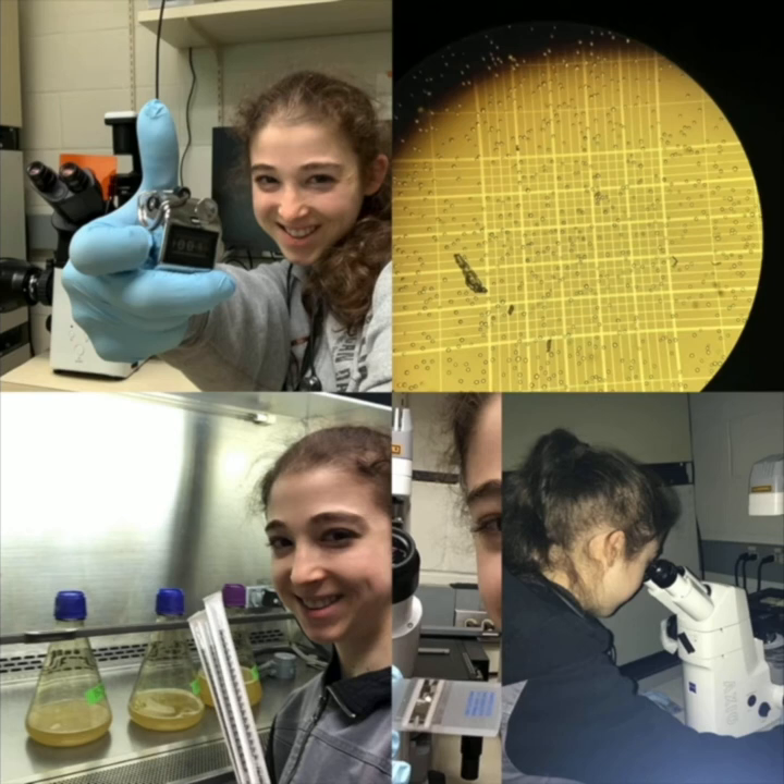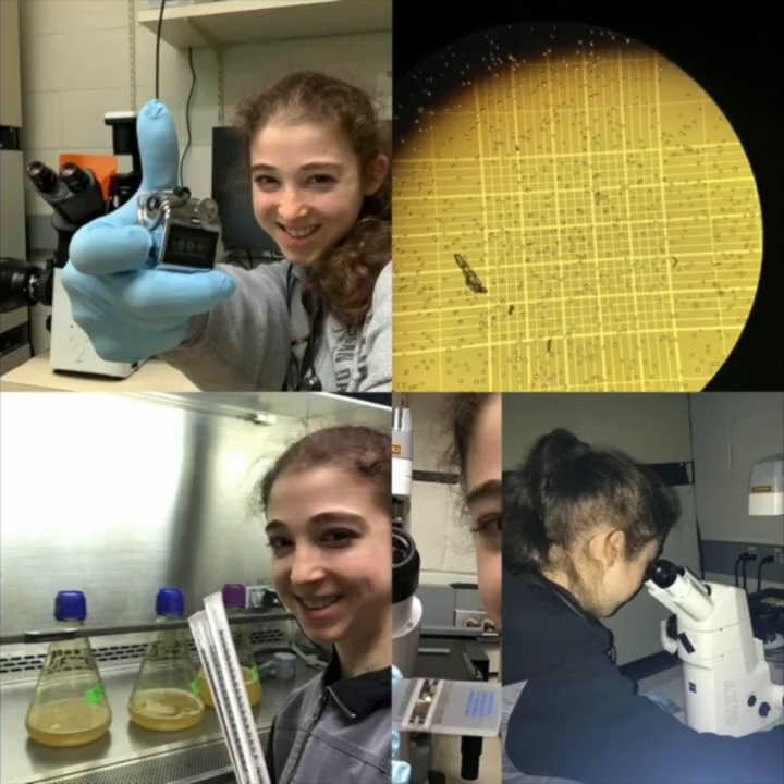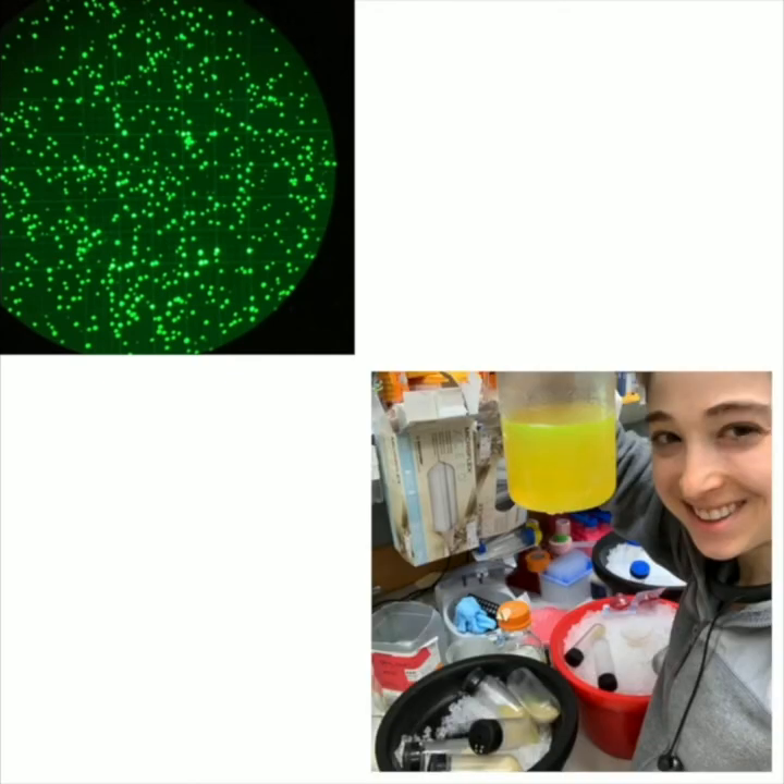We look under the microscope during all phases, keeping a close eye on the cells to make sure they look healthy, counting them to see when we need to split them and add more media so they don't overgrow. We can use special light, and if the cells are making YFP, they're going to glow. Even though our protein isn't yellow, we're co-expressing this yellow protein, so the liquid looks really fluorescent yellow, which is pretty cool.